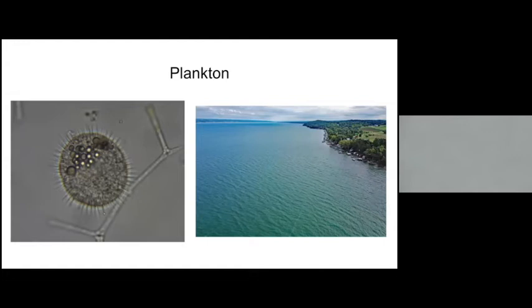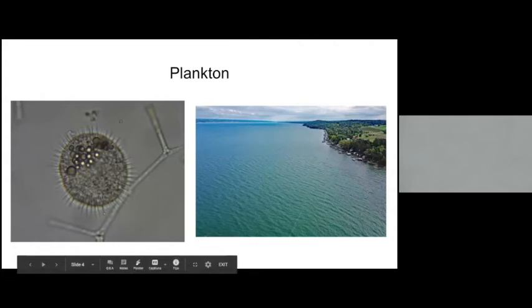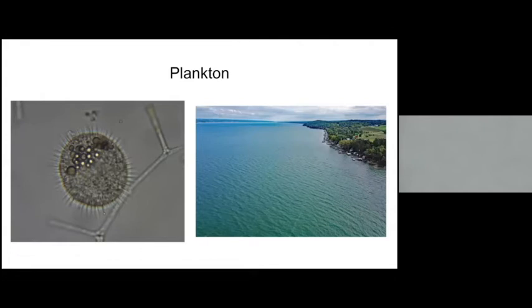Yes. But those of you who said it looks like a cell or a germ, that is really close because it is a single-celled plankton. So you are also correct. It is a cell. And germs might also be a single cell. So you guys were definitely on the right track. Your observations were leading you to a good place. Based on the size, you all got really, really spot on. That was really good. Okay, I think I will go to the next one just to make sure we have time for the game.